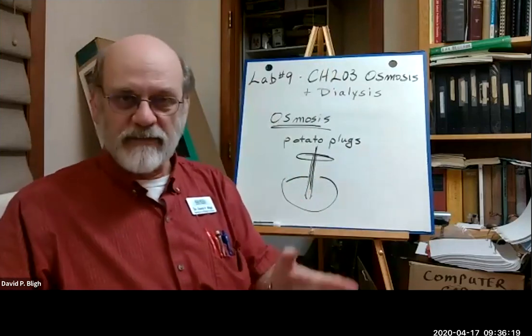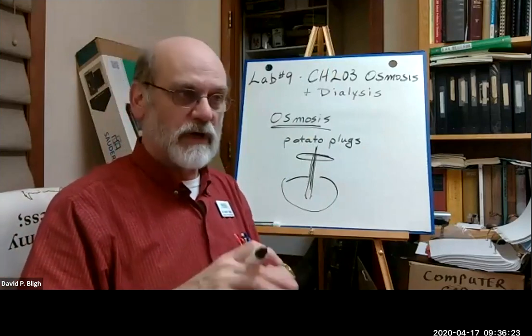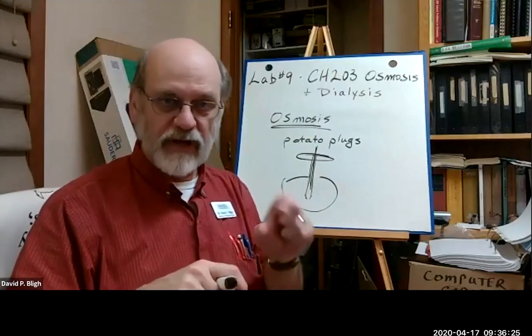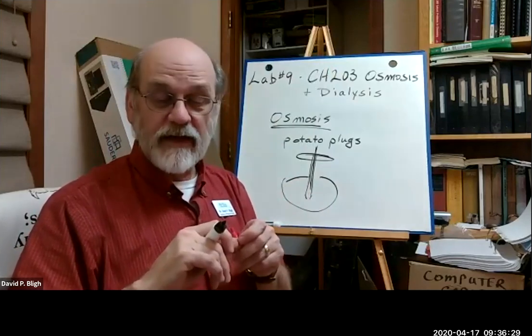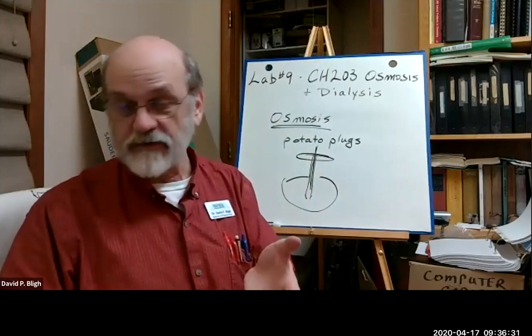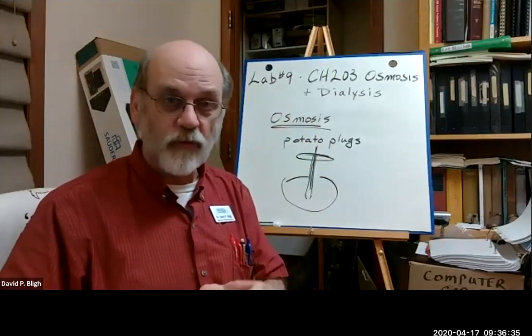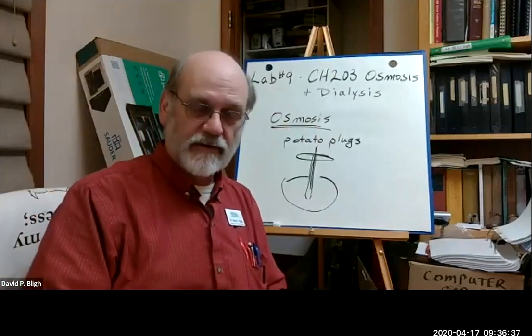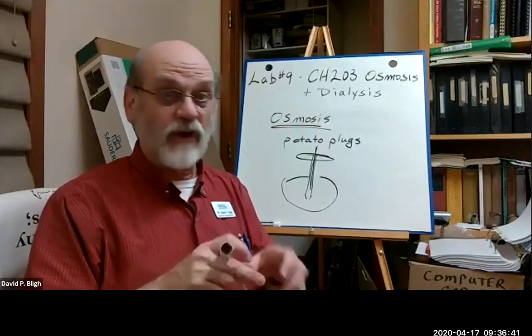And then after so many minutes, whatever the lab calls for, you remove your plug of potato and towel dry it, and then you make observations. You make visual observations and physical observations beforehand and then after. You know, did it get limp? Did it get stiff? Did it get really hard?